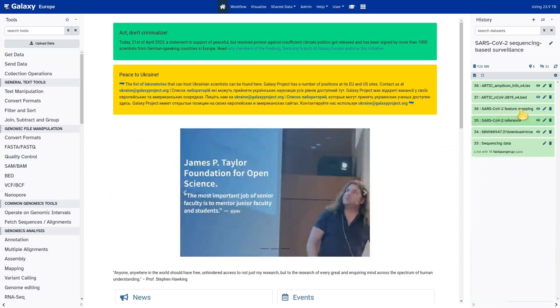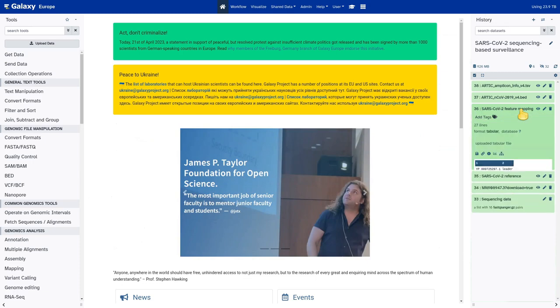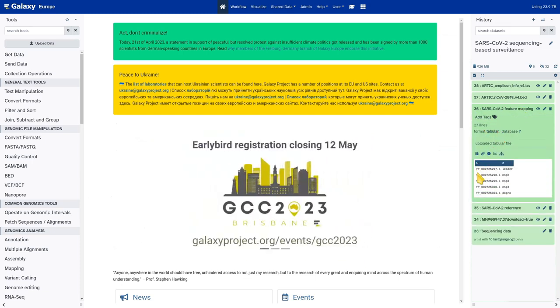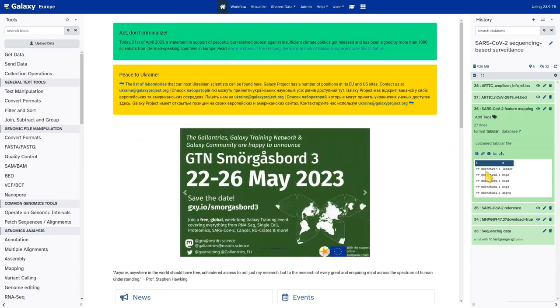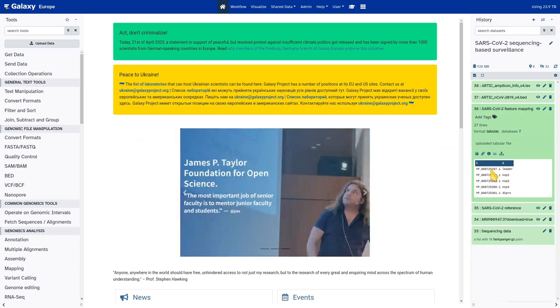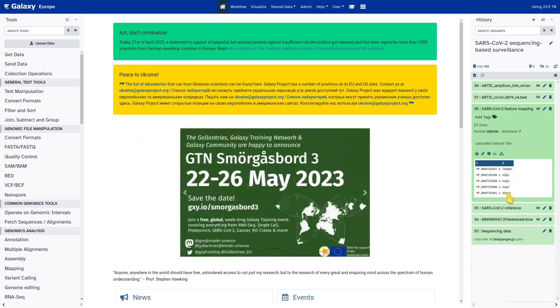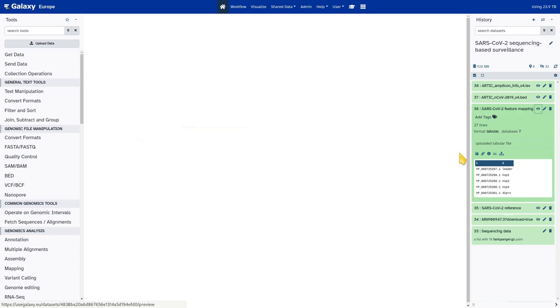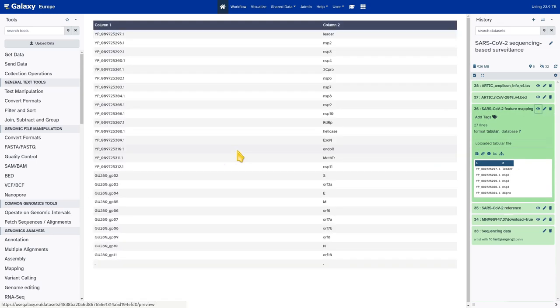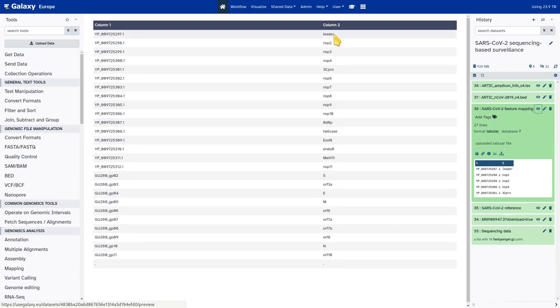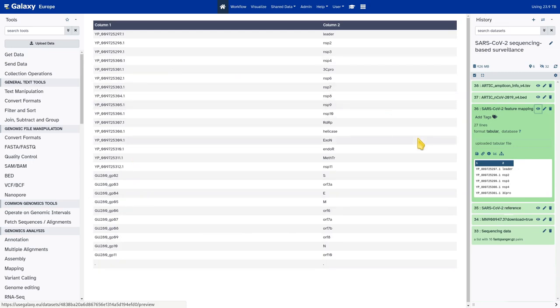I've also uploaded the SARS-CoV-2 dataset-to-feature mapping according to the instructions. That's a tabular file with the different RefSeq identifiers of all the open reading frames and peptides in the SARS-CoV-2 genome in the first column, and then the more readable common names of those features in the second column. We can go to a full view of that dataset in the middle panel — it looks as the tutorial shows it. The important thing is the format is tabular.